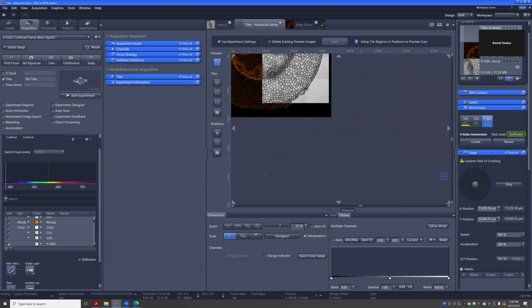What I want is that water drop to be right next to where the lenses are. We can add some more too. So if you hit that create button, yeah, it adds extra water. And you can set the volume for that?